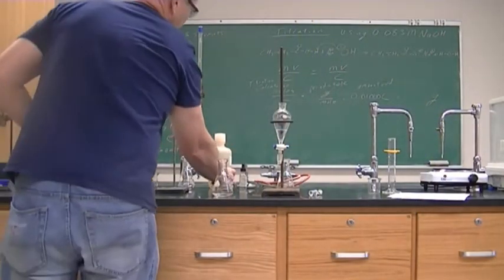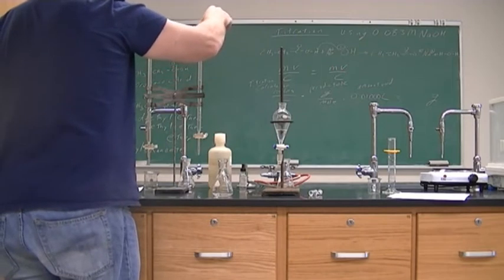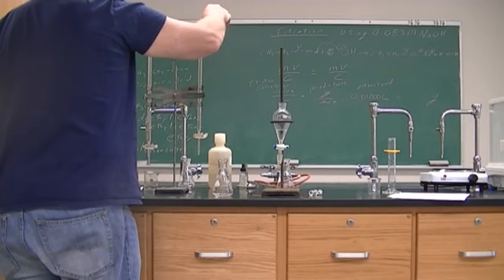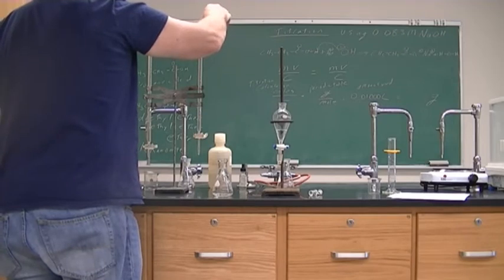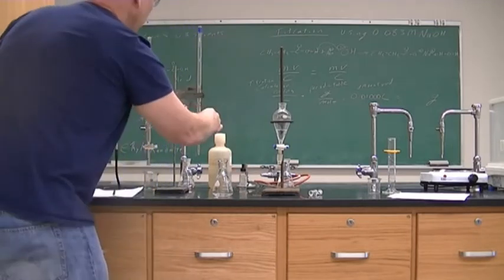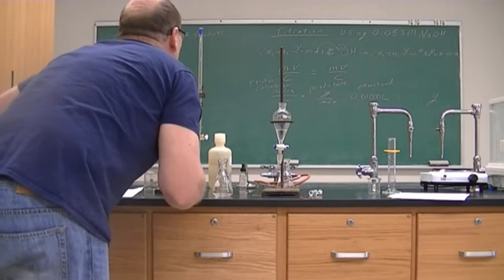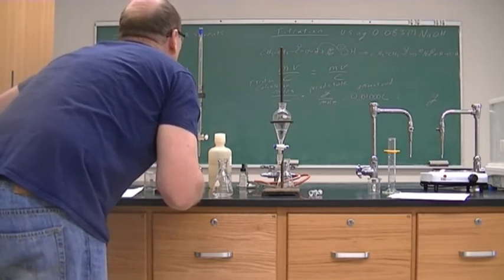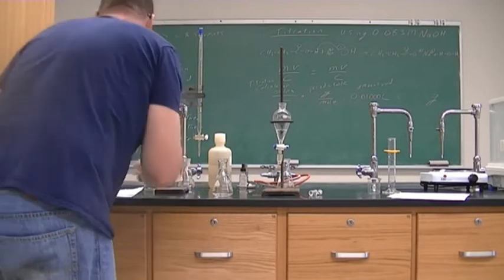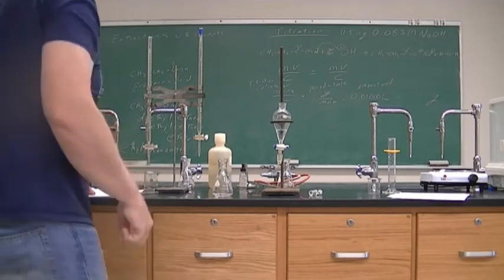So we want to fill up our base. This time our initial volume is 2.70 milliliters.